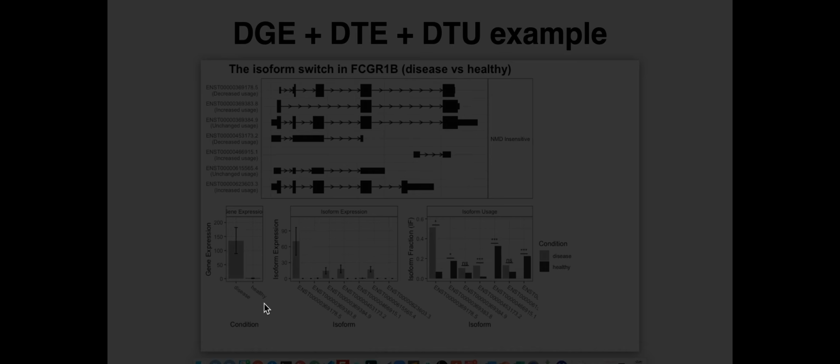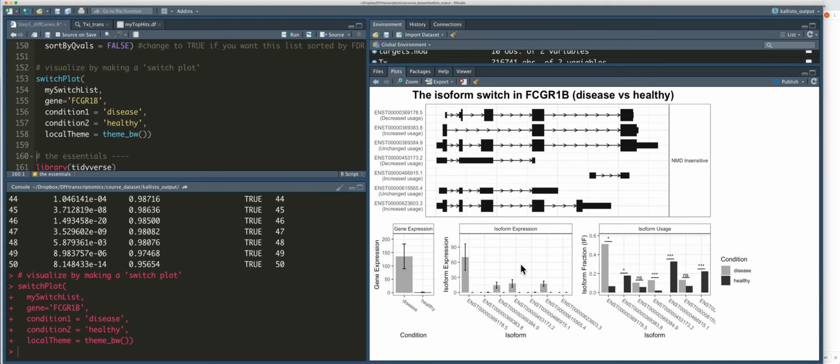Okay, so back to RStudio, and it of course finished making that plot, and I could do that for any of the genes that I want. And I just want to show you this because it's really a quick and easy way relative to anything else of just really carrying forward from your differential gene expression analysis to doing differential transcript usage really seamlessly.